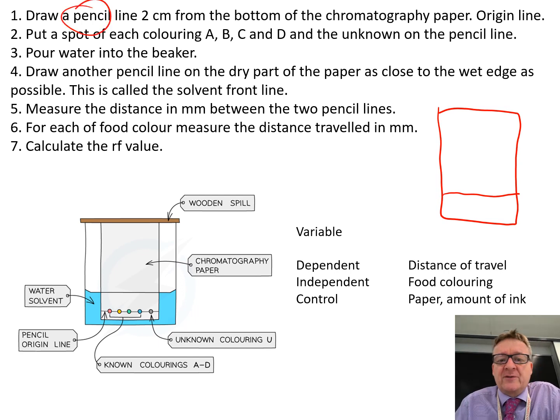Put a spot of each coloring A, B, C, D and the unknown on the pencil line. That's done with capillary tubes. It's a really thin piece of glass—you dip it into your food coloring and put a little tiny spot on there.